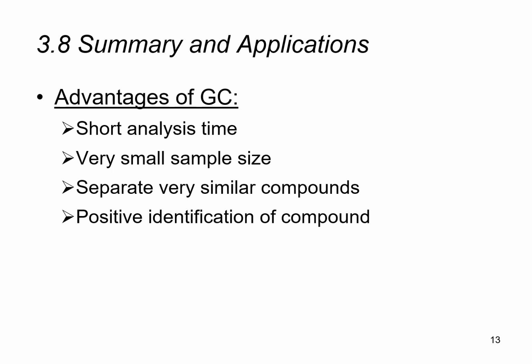Now, there are many advantages of using gas chromatography as a method of analysis. Most gas chromatography experiments can be completed in 15 to 20 minutes, so that is a reasonably short analysis time, right? It also only requires a very small sample size. You noted that our injection volumes are on the scale of 1 to 2 microliters, which is very little. So that's really helpful when we have only a limited amount of sample available for injection.